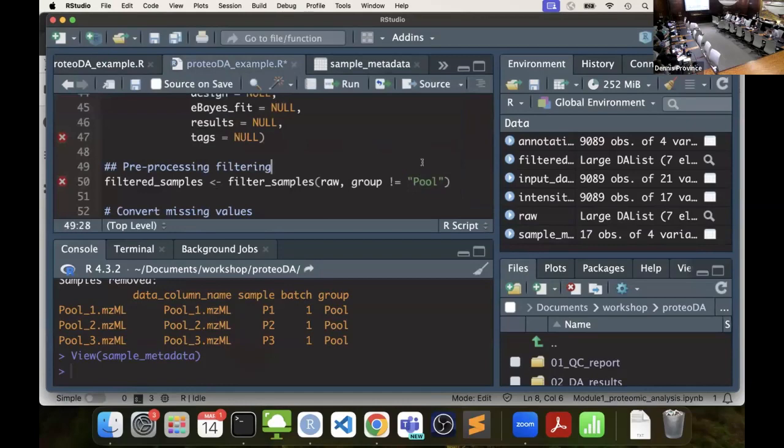So everything that I've kind of got highlighted in green is something that is related to your input file, how you defined it. And don't remember green because that's the color version I have in my RStudio. When you pop up RStudio the first time, it's probably all going to be white and not this color. But anyway.